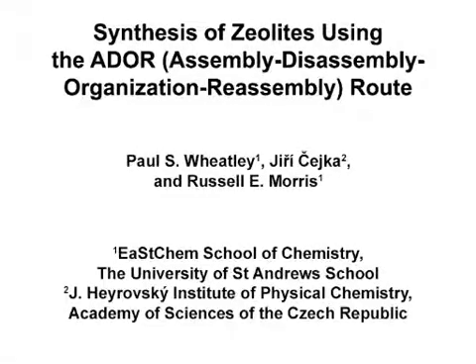The overall goal of this video is to demonstrate the assembly, disassembly, organization, reassembly method to prepare new zeolite materials by disassembling a pre-assembled zeolite into its components before organizing and reassembling them in different ways to form new materials.